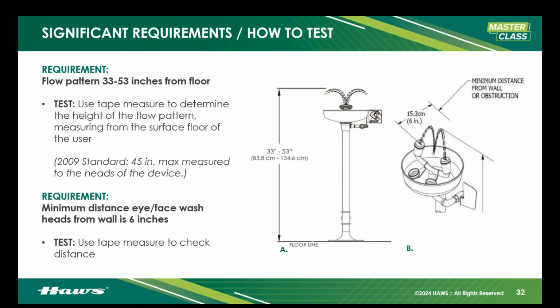So if you have a 2-headed device like you see on the right, you're measuring from those heads 6 inches in diameter around the heads, okay? On a single head device, like you see on the left, like the Axion, you're measuring from that head in a circle. It's nicely contained in the bowl. So ensure on the 2-headed devices, 4-headed devices, there's so many different types out there. But as you're measuring around those heads, ensure that you don't have obstructions near that equipment either, okay?